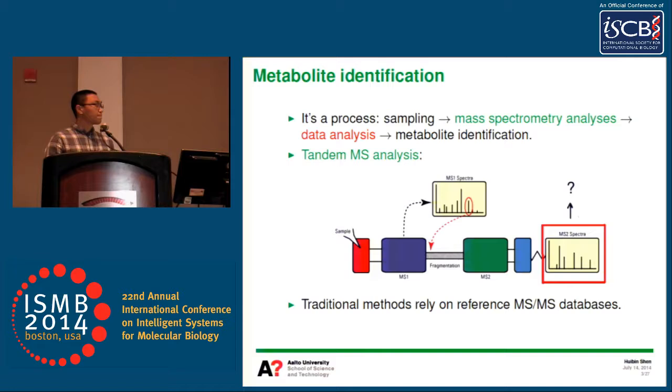So our problem is that given the MS-MS spectrum here, what is actually the molecule it corresponds to? Traditionally, the methods people were using often just compare the mass spectral peak by peak and find the most similar one.